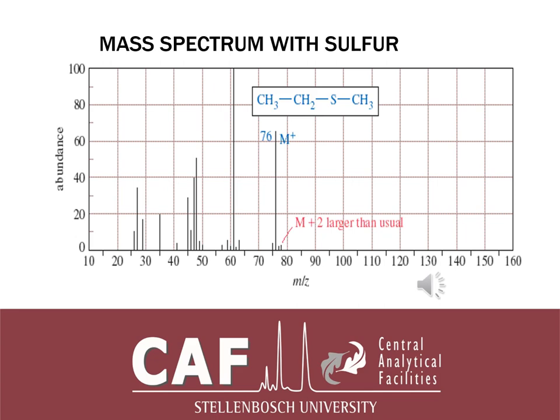As I said earlier, it's important to understand that fragmentation won't happen from the right first. It's first going to happen on the left, because that's the simplest it can be. The sulfur makes it difficult for the molecule to start fragmenting on one side, so it fragments further away from the heteroatom.